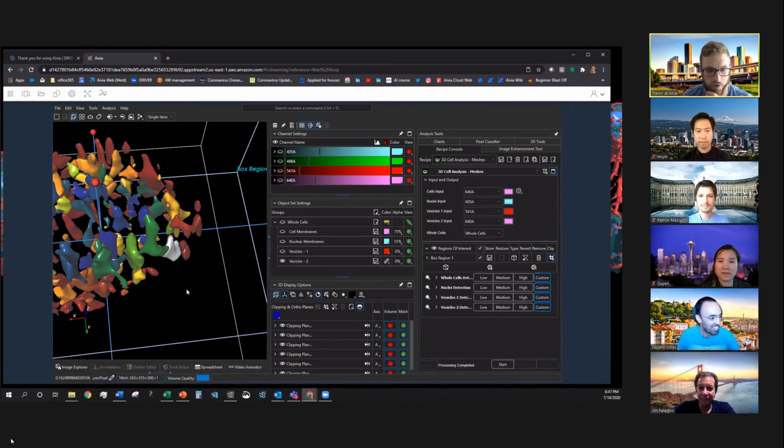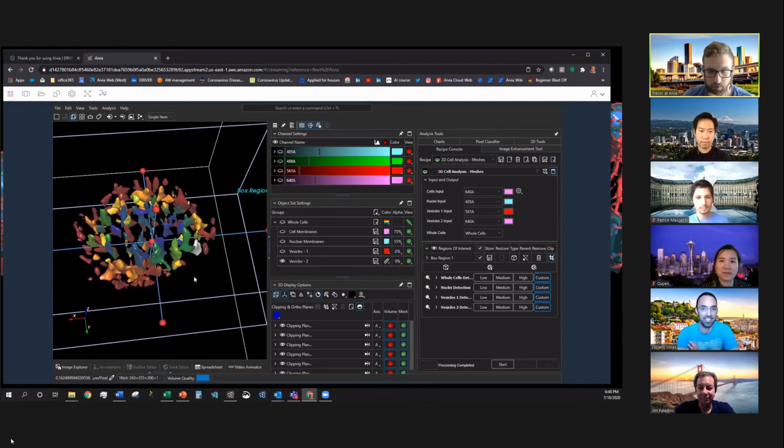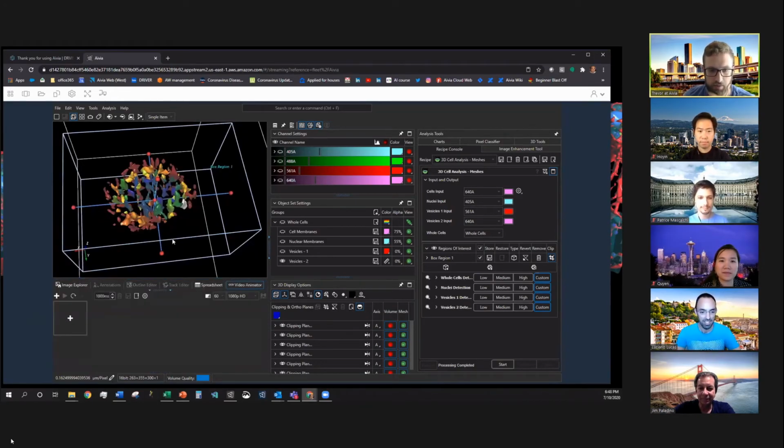Yeah, more importantly, if you click on that, then I'm controlling the mouse now from Houston, and I can click on this instead and say, no, look at that one, or this one or that one. We can go back and forth like this. One of the cool things about this collaborative mechanism is the ability to go through an animation process together.